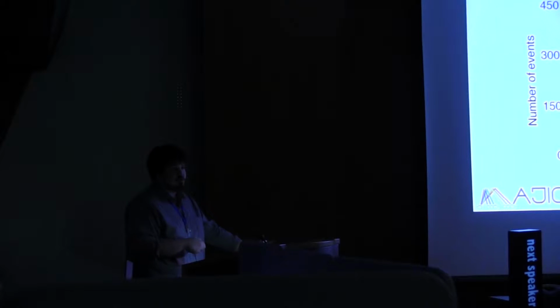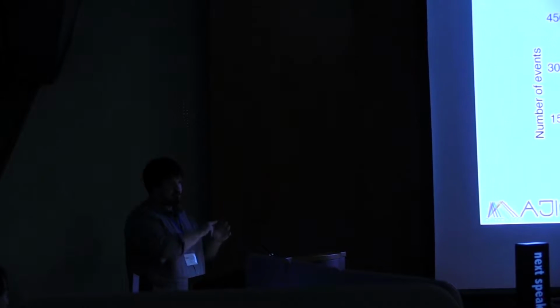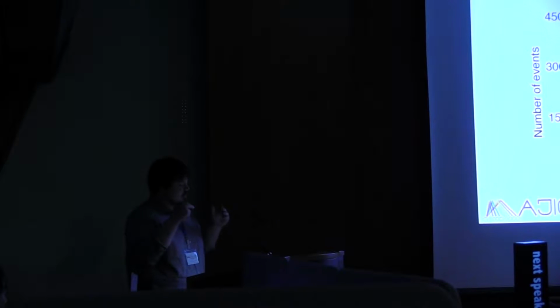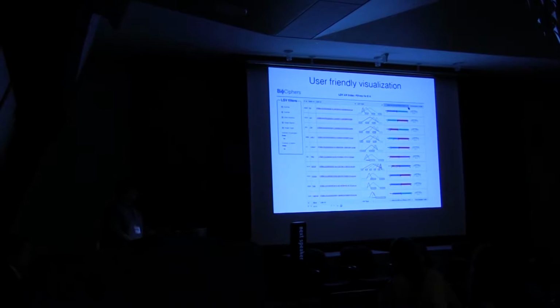And this is comparing two normal mouse tissues. We're not knocking down splicing factors, looking across all brain development, or looking at cancer or some sort of crazy disease. So if you're not using de novo junction detection, then you're going to be missing probably more than this. It's a lower bound.